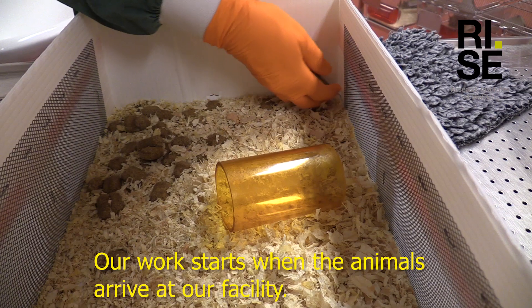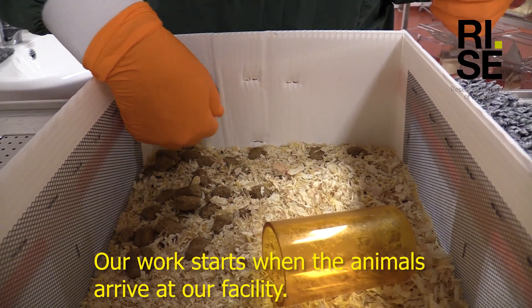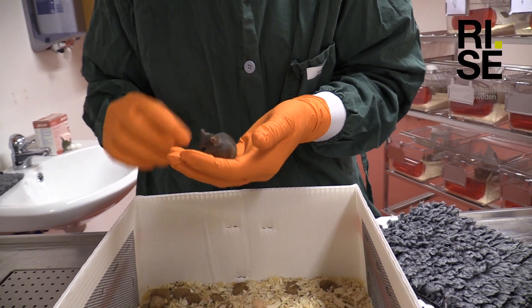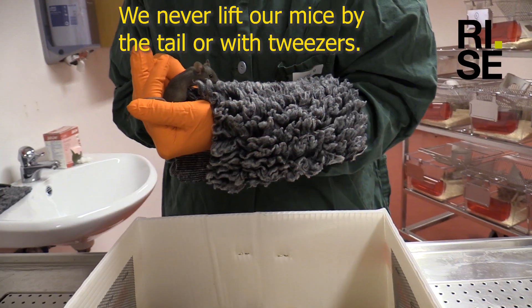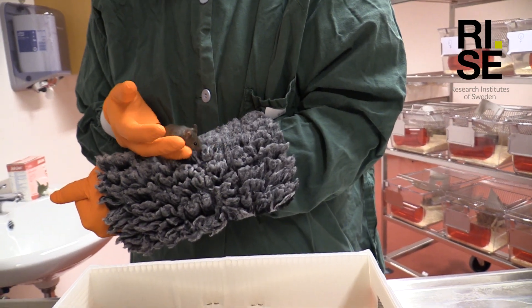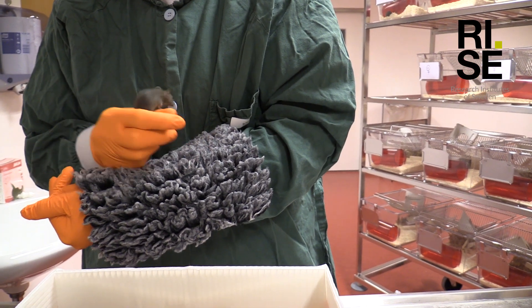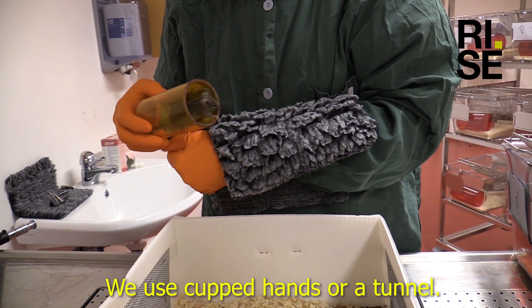Housing, handling and training mice at RISE. Our work starts when the animals arrive at our facility. We never lift our mice by the tail or with tweezers. We use cupped hands or a tunnel.